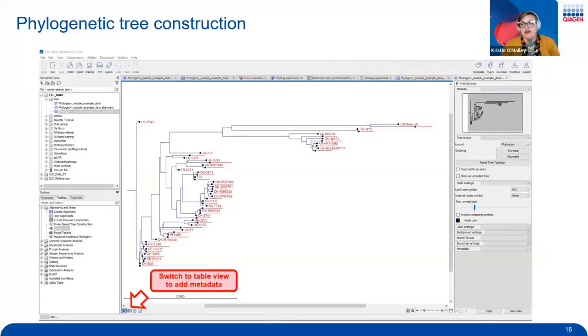What we did was then manipulate what we saw in the center view here by looking at our tree layouts and maybe changing them from a phylogram over to this radial view and so forth. But mostly we wanted to really add in our metadata so we can take advantage of that metadata and color code these sample dots.